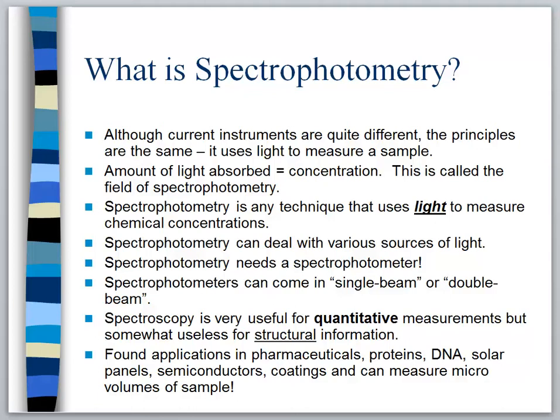All right, so previously we talked about the instrument and we started talking a little bit about the theory that goes along with the instrument, and we said that this really is important in quantitative work and it uses UV and visible to do the quantitative work. And UV and visible have now been assigned wavelengths. And now we know what the definition of a wavelength is.